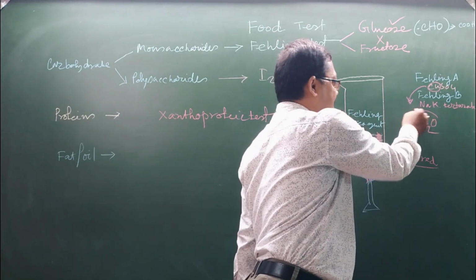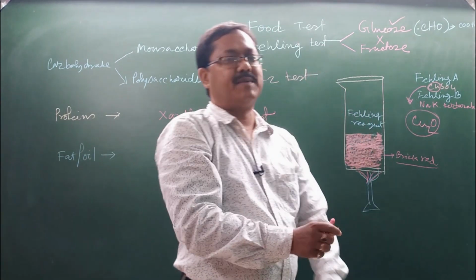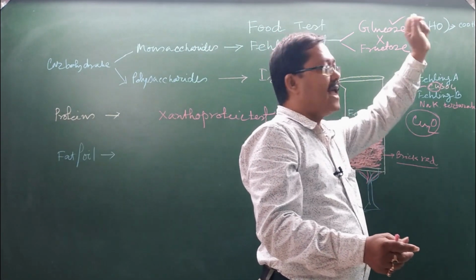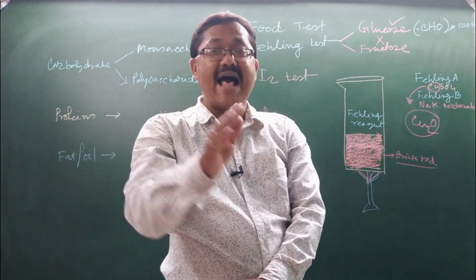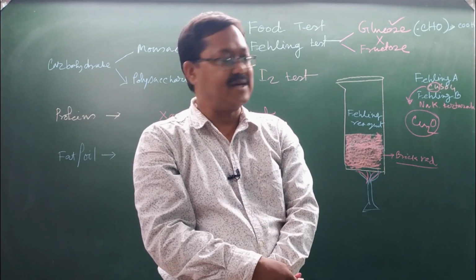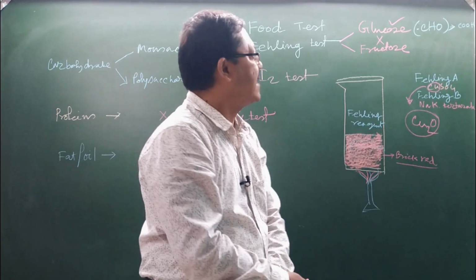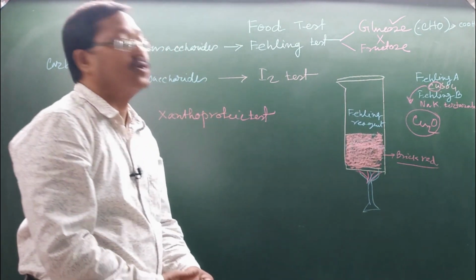This imparts the brick red color to the solution, and the aldehyde group, reducing, is converted into acid.